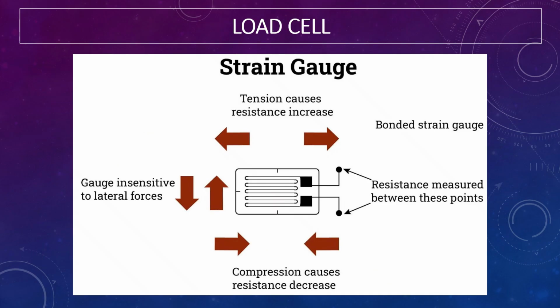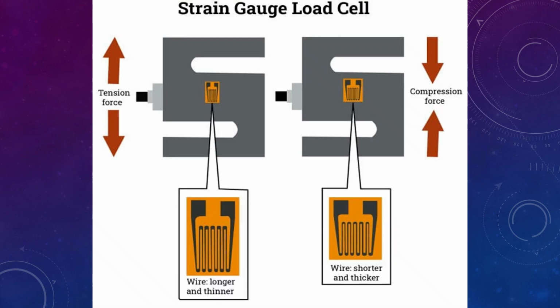This load cell is to measure the stress or the pressure applied on the material or the sample. It is sensitive to left and right and insensitive to up and down. Then you can put this in something, and it will be compressed, and it will compress the sensor, and then the resistance will change according to the length it is compressed.